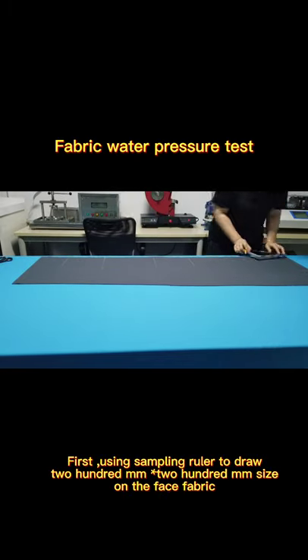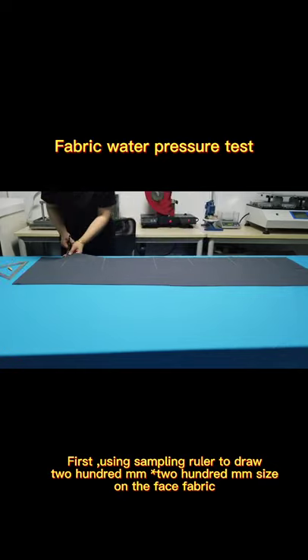First, using sampling ruler to draw 200mm by 200mm squares on the face fabric.